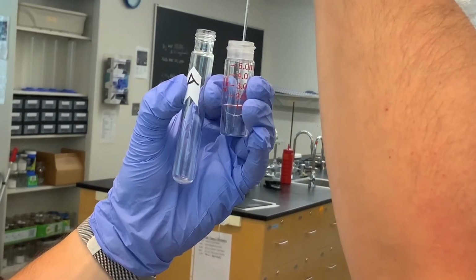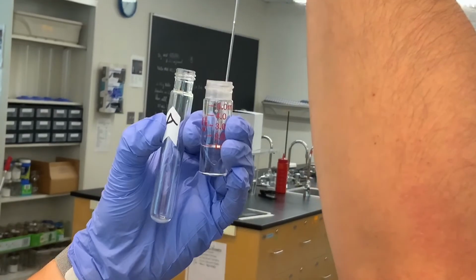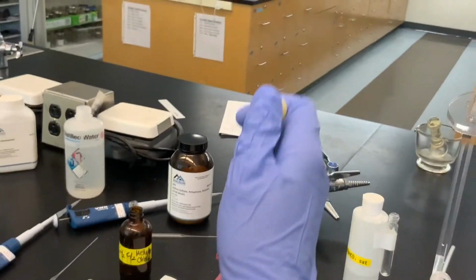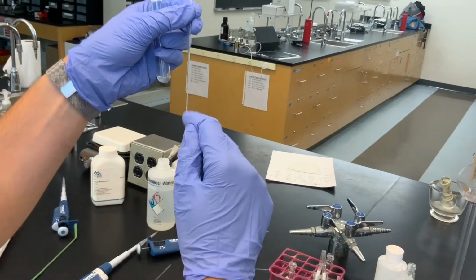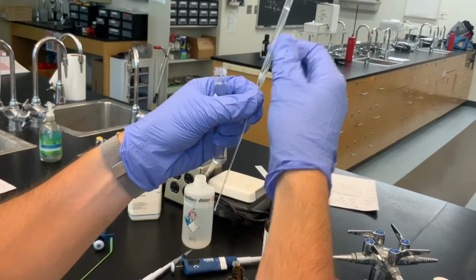So I'm just diving down, trying to avoid as much water as I possibly can. And I've now delivered the organic layer to the first culture tube. And you'll remember that I said something about the benzoic acid being on the tip of the Pasteur pipette. You can also see it on the interior here as well.